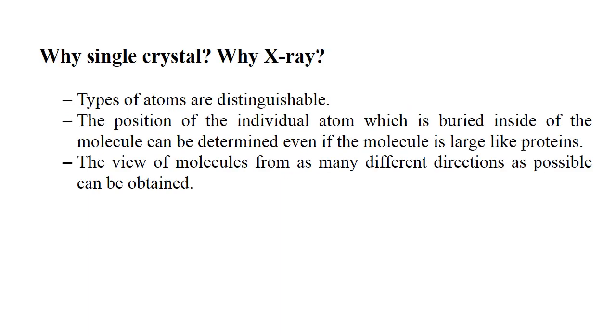Why do we need single crystal X-ray diffraction? Why single crystal? Why X-ray? Why is a single crystal necessary, and why are X-rays used for X-ray crystallography? For viewing the three-dimensional structure of atoms quantitatively, it is required to satisfy the following three conditions. First, the types of atoms are distinguishable.